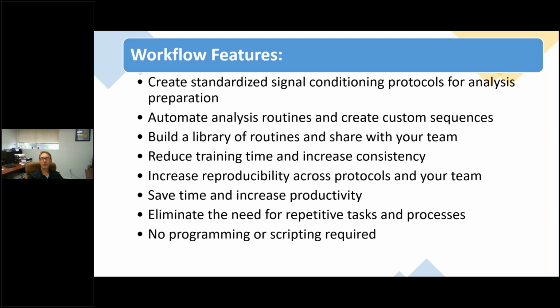This helps to reduce training time, because if you've got a technician that needs to go through and perform certain tasks, you can just train them on running the workflow, what the data should look like going in and what the data should look like coming out. And that simplifies having to train them on every single step. Like, they'll begin to understand what's going on, but it definitely helps you speed the process up.